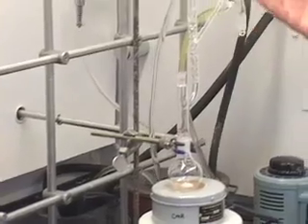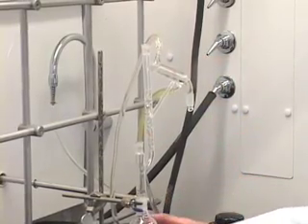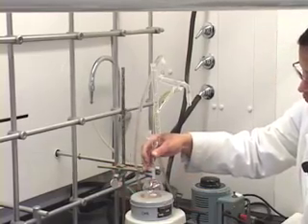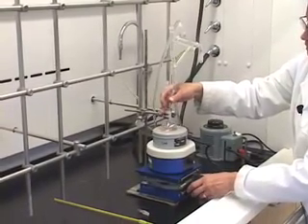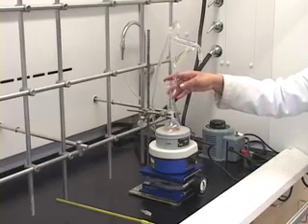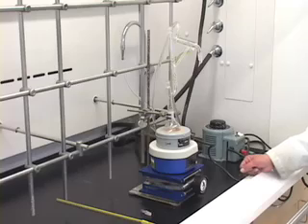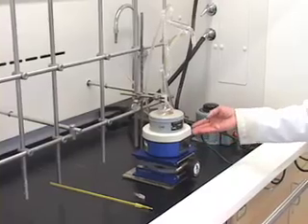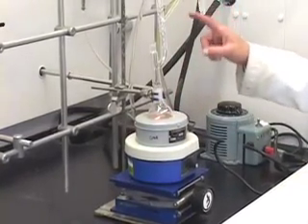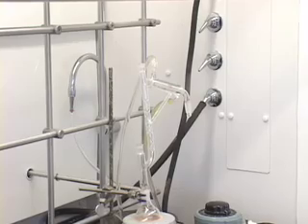We have the distillation head set up and cold water running through the condenser. Make sure the clamp is attached tightly and the jack is raised so it sits properly. We also need glassware to collect the distilling liquid. To summarize: ring stand, jack, magnetic stirrer, heating mantle, round bottom flask with your sample, distillation head, condenser connected to water, water running — now we can get our sample and start the distillation.